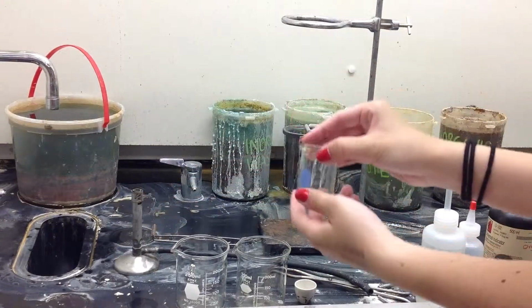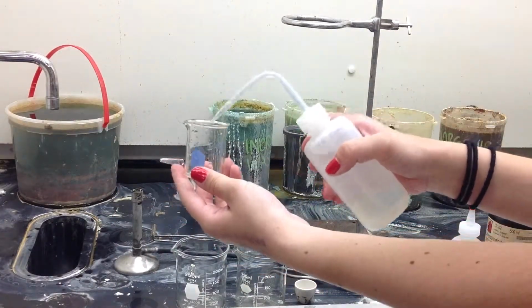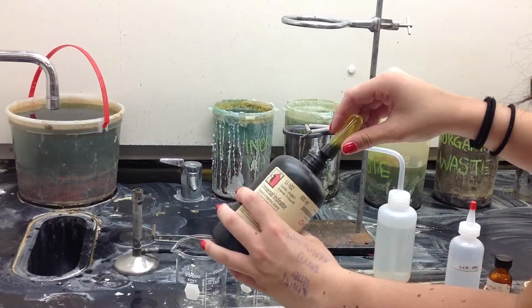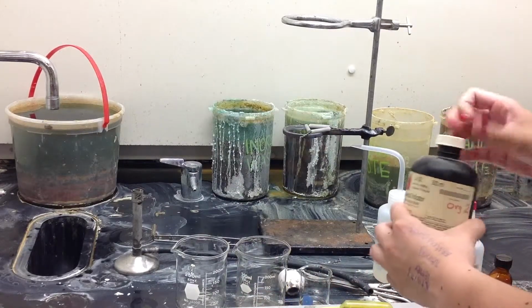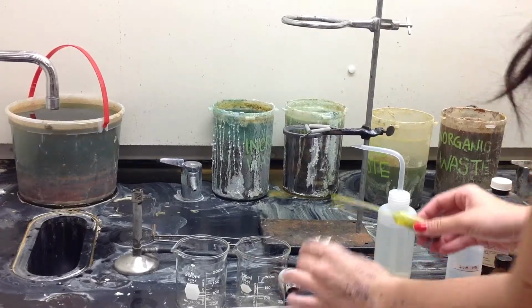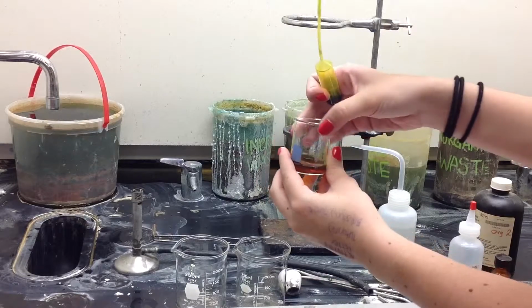First, we take one of the 3 beakers and pour tap water into it. Distilled water is a bit acidic, so the outcome of this control is not dependable. Then we add a few drops of universal indicator into it. We will record the color of the solution, which is green, and then set the beaker aside as a control for the neutral solution.